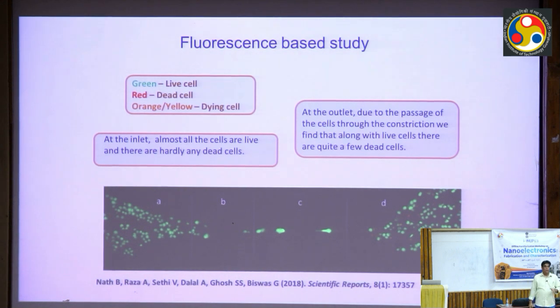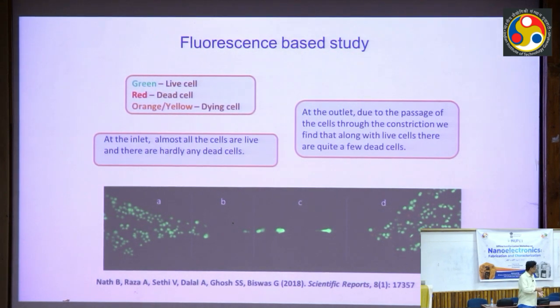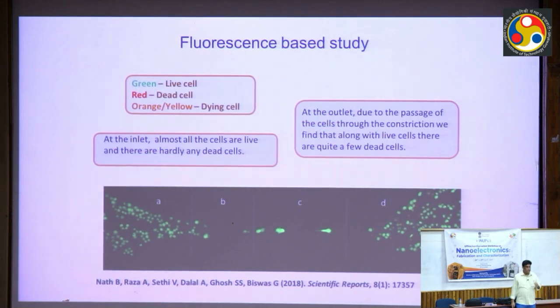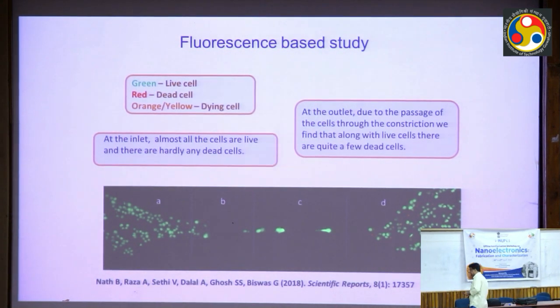We have understood all the molecular mechanisms involved in the process, all the signaling events in the process, but because of the heterogeneity of the audience, this may not be the right place to put all the values. I want to give the message that the cells are actually fully functional, capable of regenerating, and can again cause all the defects that they are supposed to do. So this event monitoring is possible in the process to get biological insight into the system.